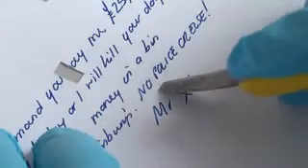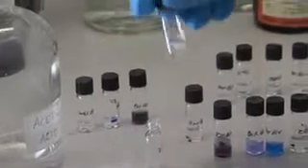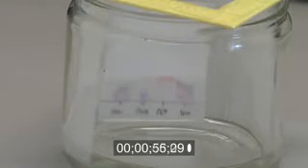Sometimes it may not be possible to tell inks apart using these 2 tests, even if they do contain different chemical ingredients. When this happens, a 3rd test, called thin layer chromatography, or TLC for short, can be used. Samples of the ink are removed from the document, dissolved into a chemical solvent, and transferred onto a flat TLC plate. By placing this plate upright in a glass tank containing a small amount of a specially chosen solvent mixture, the different dye components present in different ink samples can be separated out and compared to see if the components from different areas of ink on a document are the same or different.